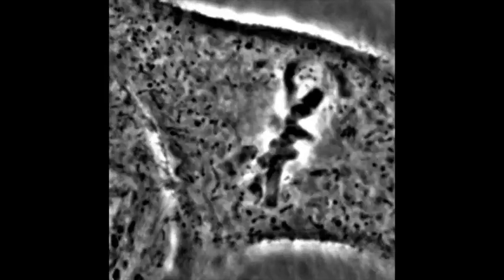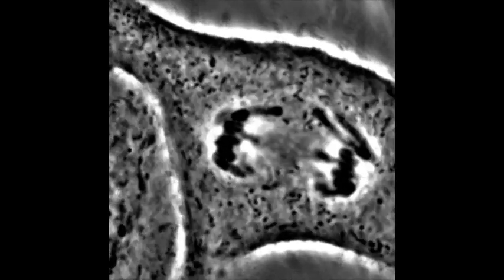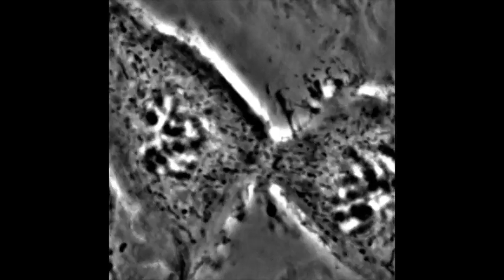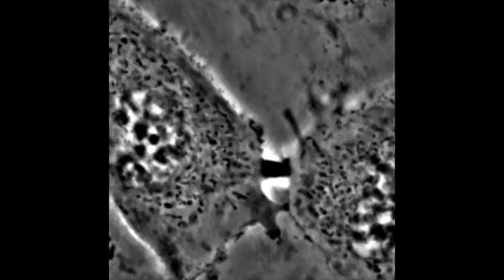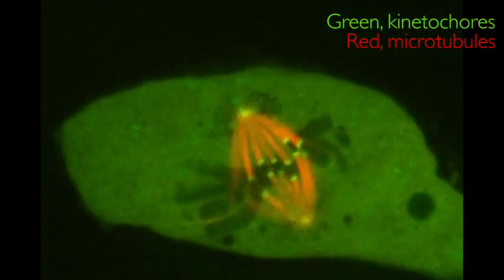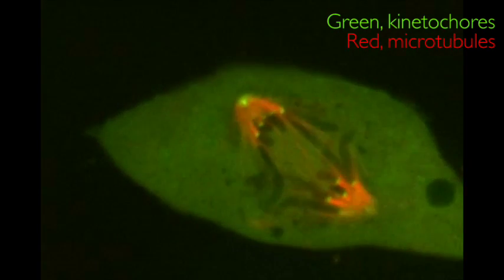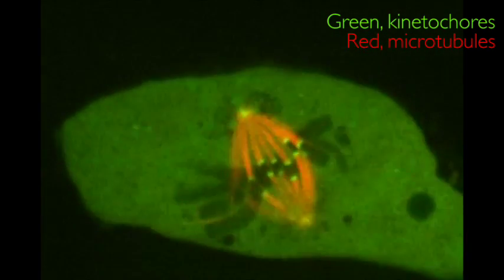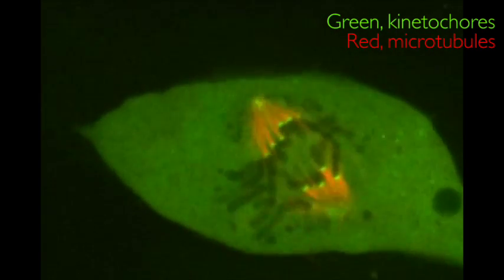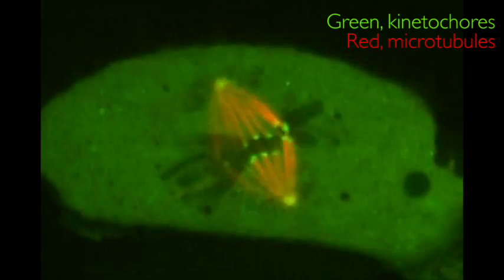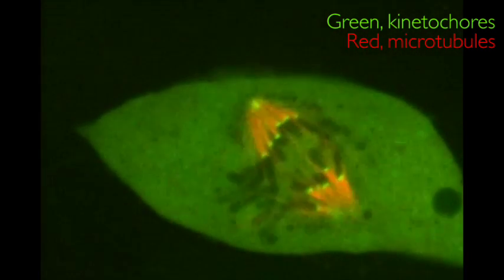The condensed chromosomes move around like an excited crowd in the center of the cell, until they are lined up in the middle. Then, quite suddenly, the sisters split apart and move to opposite sides of the cell, while the cell pinches in the middle to form two daughter cells. But how do chromosomes move? The microtubules of the mitotic spindle, shown in red in this video, find the chromosomes at attachment sites called kinetochores, shown in green, and pull the chromosomes back and forth like two teams struggling in a game of tug-of-war.